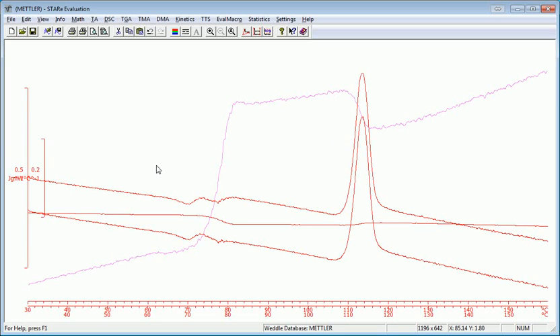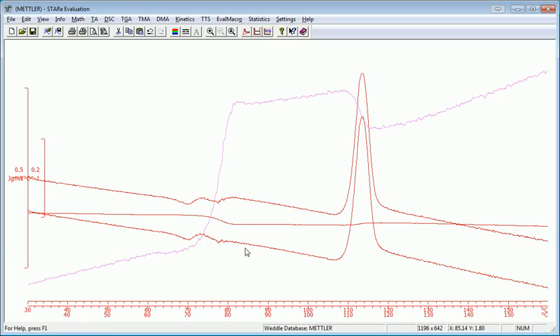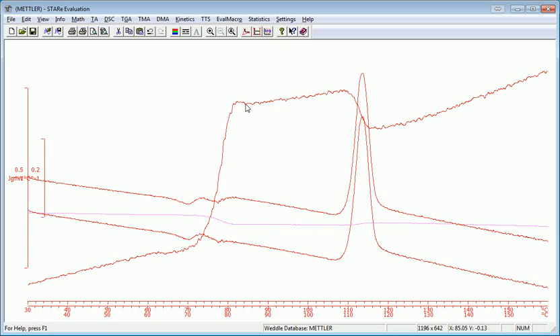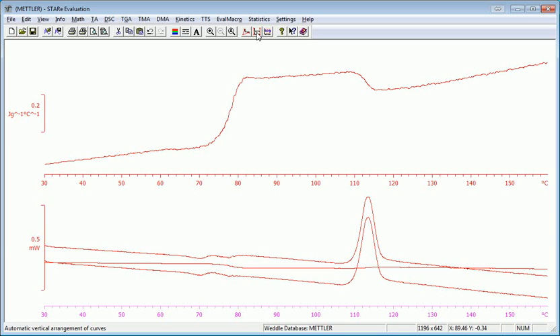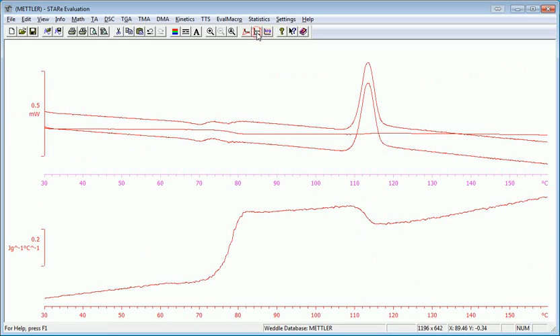Now I have overlapping axes. So as usual, I like to do the arranged coordinates. I'm going to select one of my heat flow curves. When I do that, it'll move that heat flow axis to the top. I actually have to select the x-axis for the heat flow curve and then select arrange coordinates. It puts my heat flow curves on top.